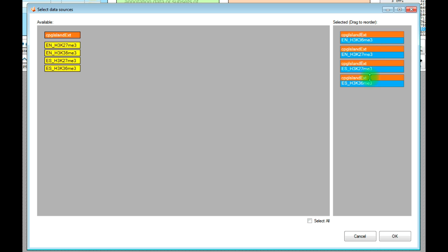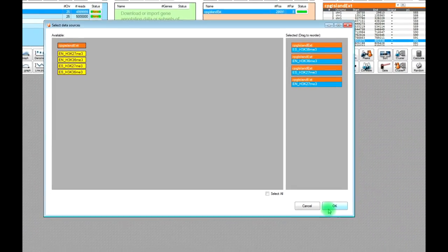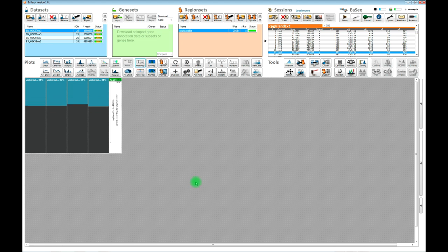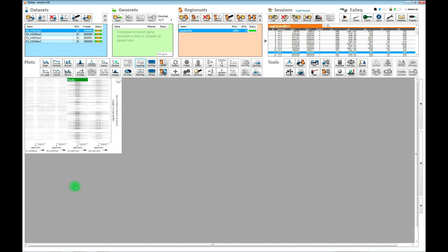If you wanted to show the K36 data first with the ES and ES endodermal, then we set up that order here. Then we can instruct EASEQ to visualize the signal at the CpG islands. The plots are updating and now we can see the signal and how it looks.